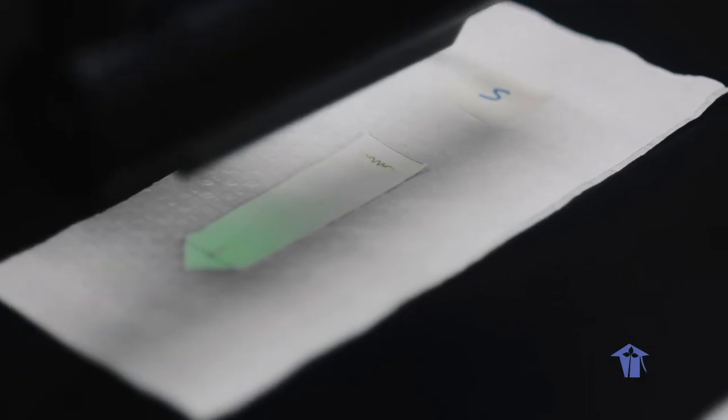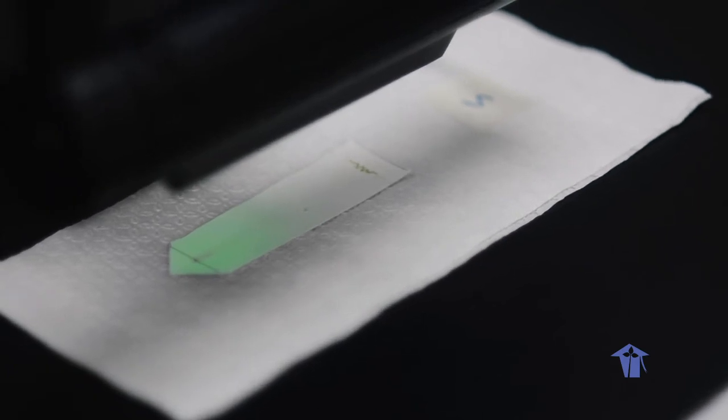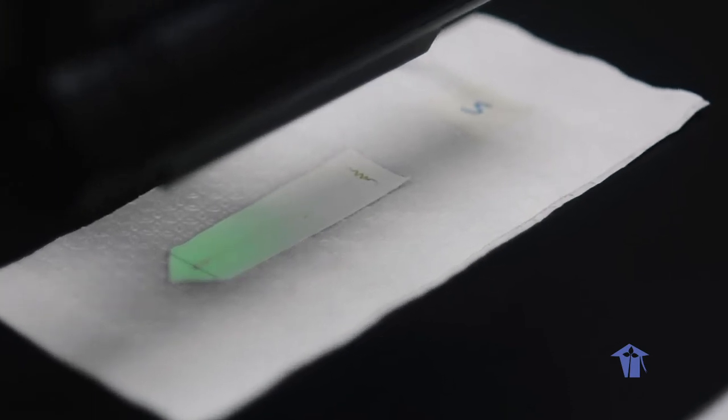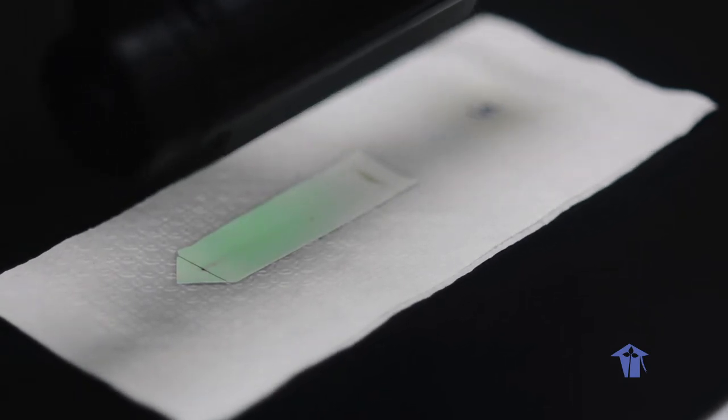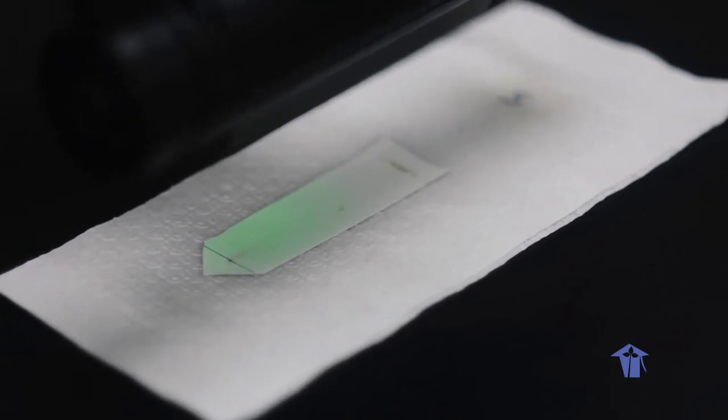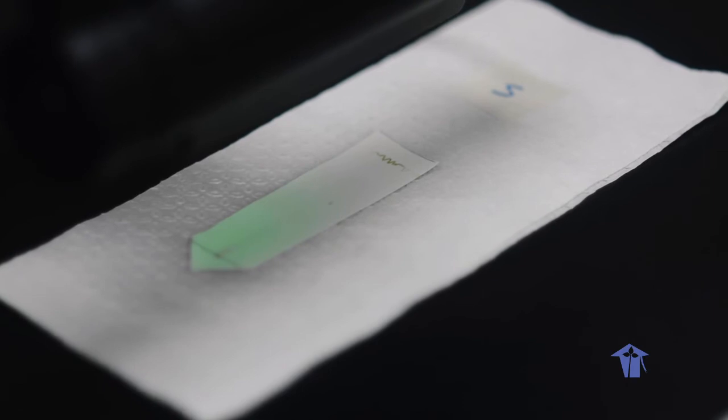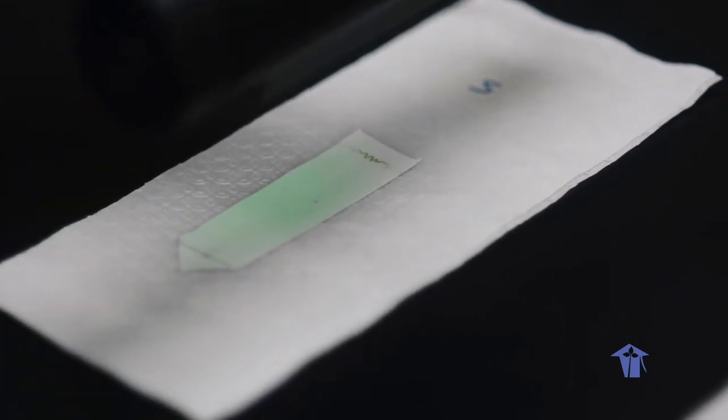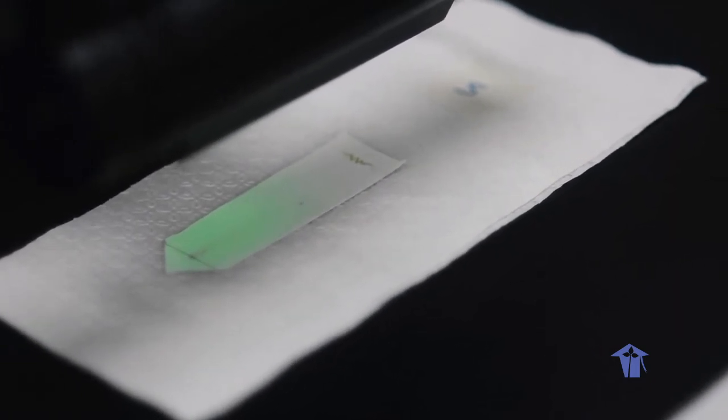Now we are going to show the results on our different pieces of chromatography paper which were in the different solutions. This is the one that was in the spinach solution. We have used a special type of chromatography paper that allows the pigments to be a little bit more easily seen when this UV lamp that I'm using is shown upon the special chromatography paper. I'm going to move this from one to the next to allow you to see what has happened with the pigments in each of the different leaf sources.